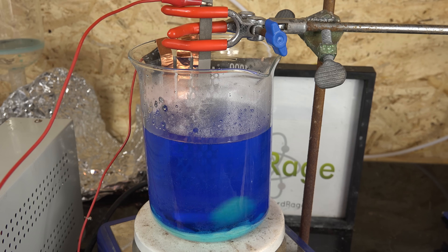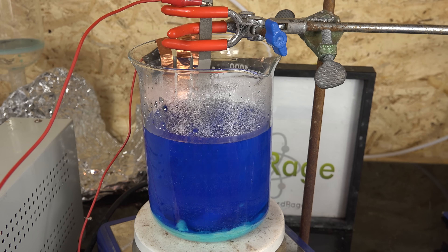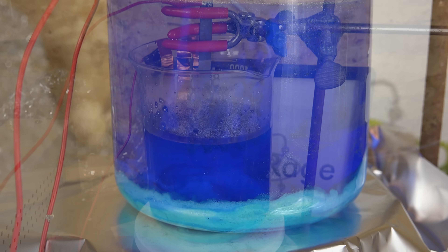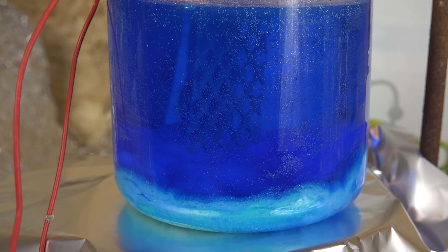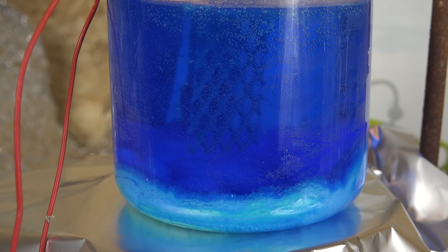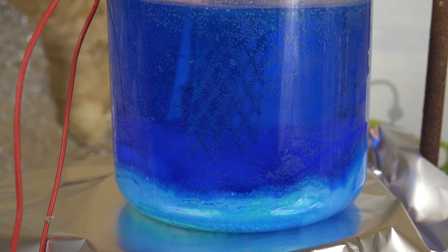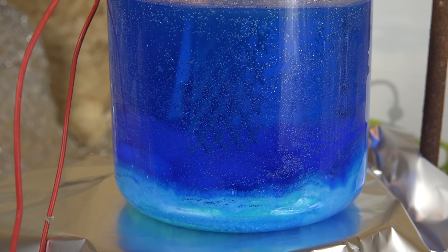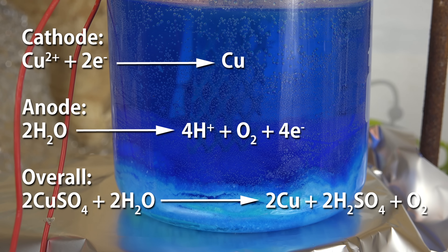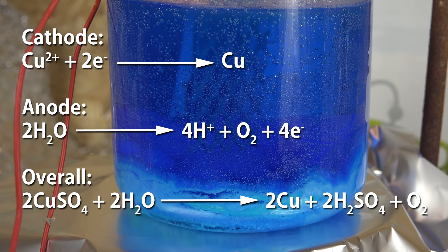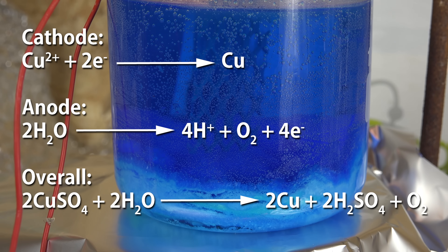Since my platinum surface area is the limiting factor in my particular cell, I'm using about 1A for my platinum electrode that has about 10 square centimeters of effective surface area. Now these numbers are very conservative and you can actually use three times more current density with little harm. But I want to minimize long term corrosion of my valuable platinum electrode. I'm going to remove the stir bar and zoom in. Now all we do is wait. At first you may see large amounts of copper sulfate crystallize out as the solution cools from our earlier mixing, but that will stop in a few hours. What we're really trying to do is electrolyze the copper sulfate solution. The copper ions deposit as copper metal at the cathode while water is electrolyzed at the anode to produce oxygen and sulfuric acid. This is how we recover both our copper and sulfuric acid for reuse.